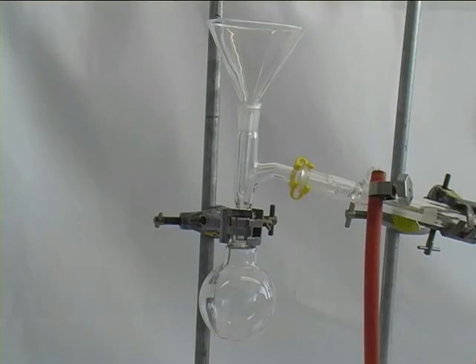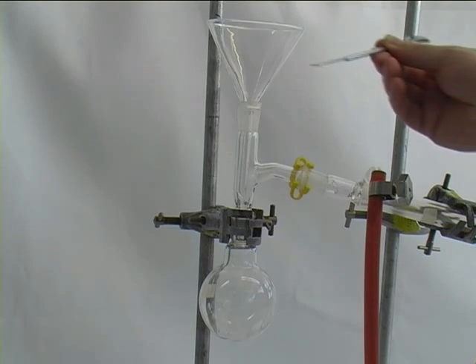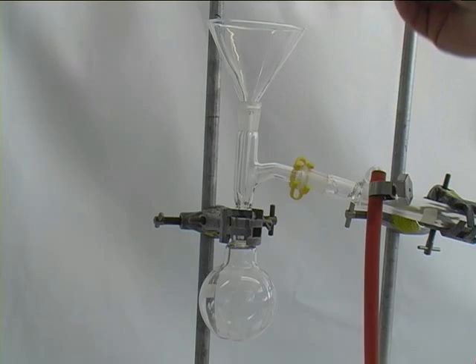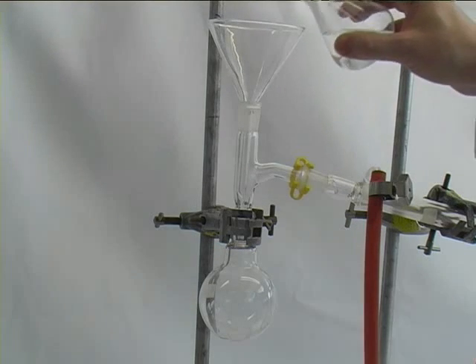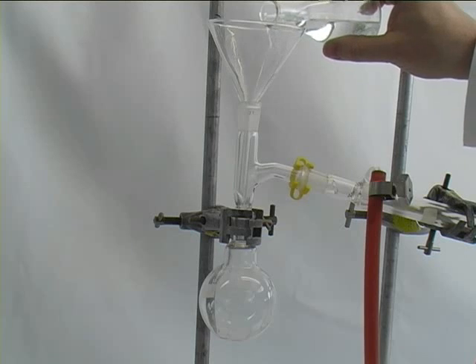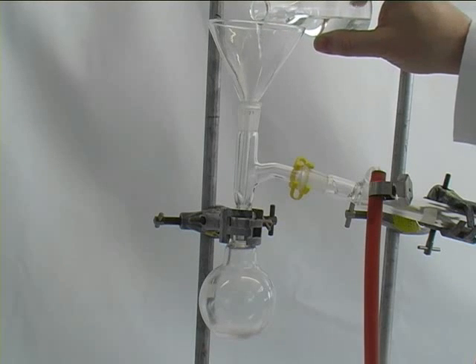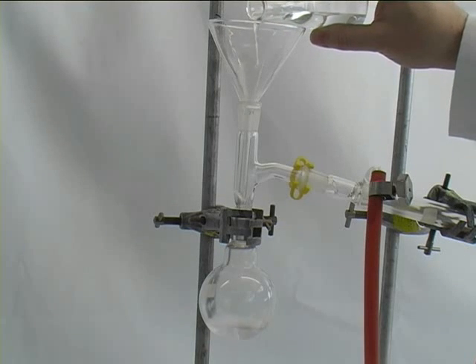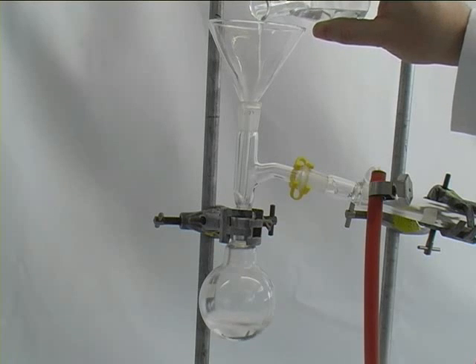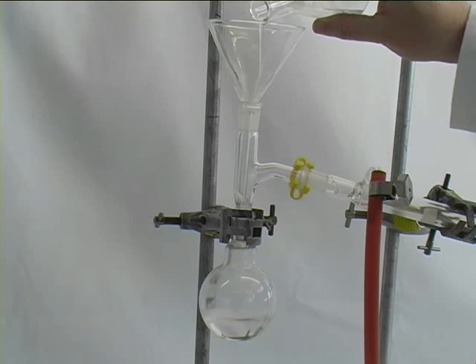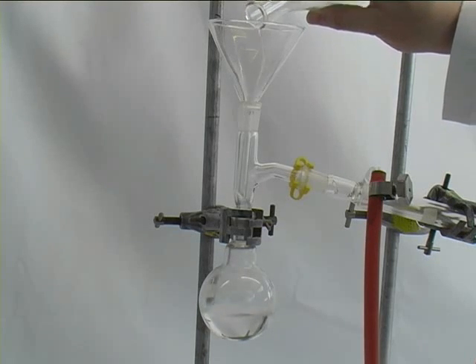Once the whole apparatus is set up, you can use a funnel to fill in some anti-bumping granules, and finally the solution which you want to separate using the atmospheric pressure distillation. Take care that when you fill it in, nothing flows down the condenser, that the solution just goes into the round bottom flask.